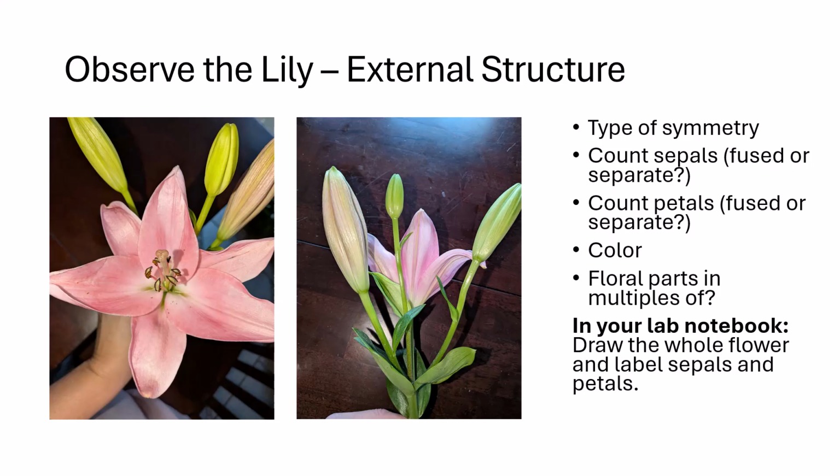Now draw the entire flower in your lab notebook. Label the sepals and petals. Focus on structural accuracy, not artistic detail. Drawing forces you to slow down and truly observe. Pause the video while you complete your sketch.